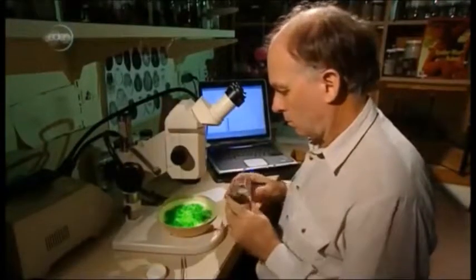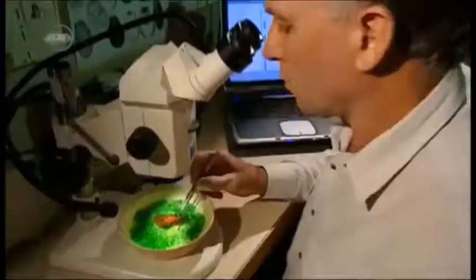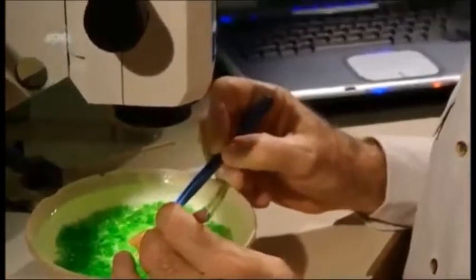Back from his field trip, Dr. Raven has preserved some of the collected spiders in alcohol. Now he must closely examine their bodies to decide which are new species. The rainforest tarantula looks very distinctive, and in typical spider fashion, its legs are the biggest giveaway. The fourth legs are much thicker.